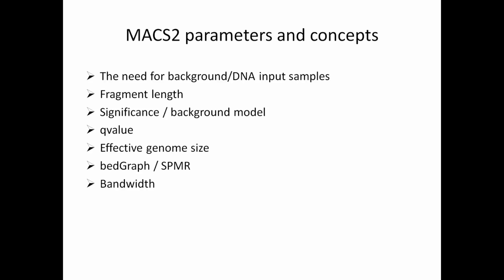The bandwidth is only used for fragment length cross-correlation when single-end reads are used. It is defined as the mean DNA fragment length as observed on a gel prior to library preparation. So this is set by the user. I just generally use a value of 300 base pairs, as the smear on a gel generally centres on this position, and to be honest it doesn't have a great effect on the general outcome.